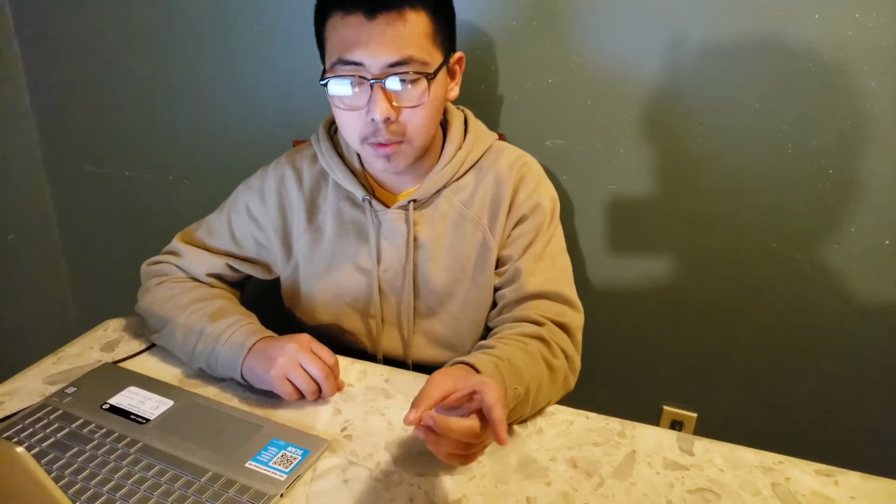Describe the differences between cups. So in the fresh cup, the fresh pineapple was floating, and in the canned label cup, the canned pineapple sunk. And in the no pineapple labeled cup, there was no pineapple to test.